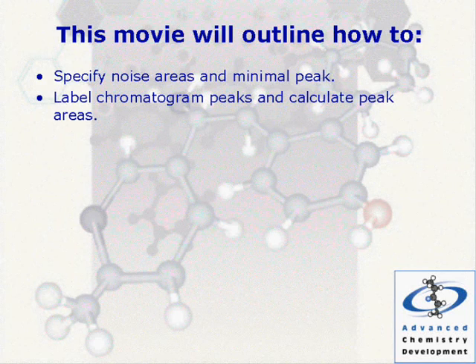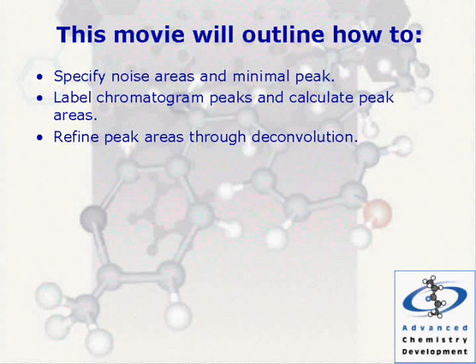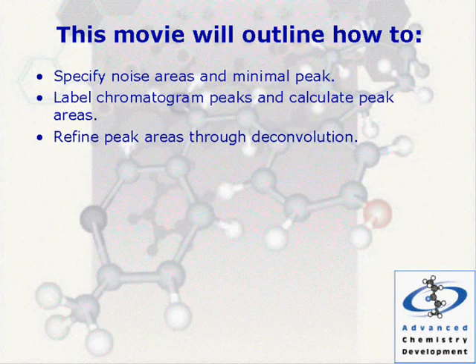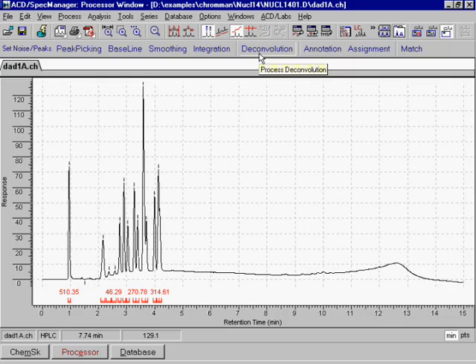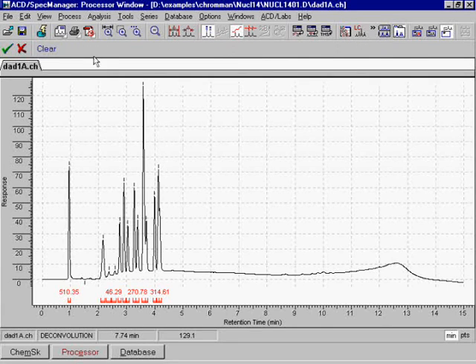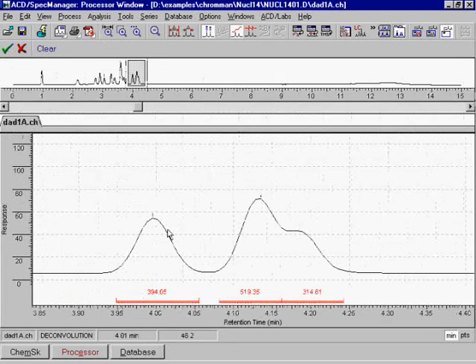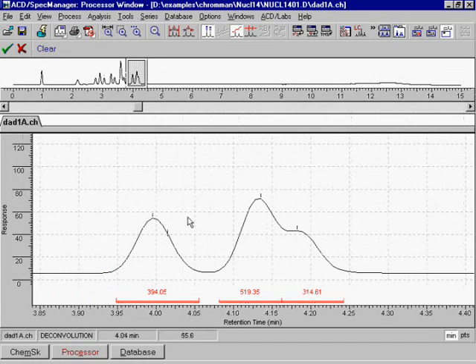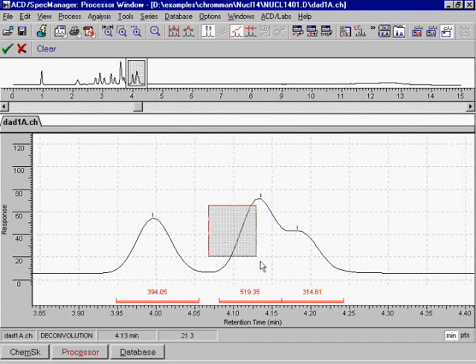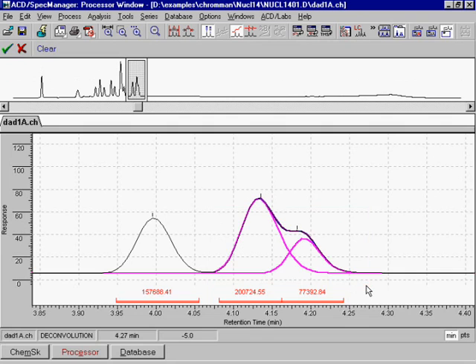Refine peak areas through deconvolution. In addition to standard peak picking and integration tools, ACD Chrome Processor has an accurate deconvolution tool for partially co-eluting peaks. Now the peak areas are more accurately defined.